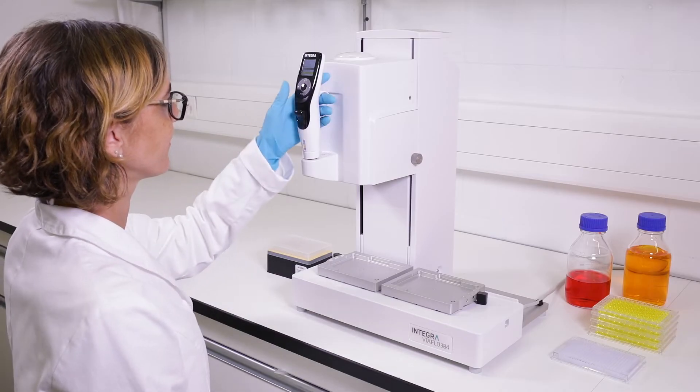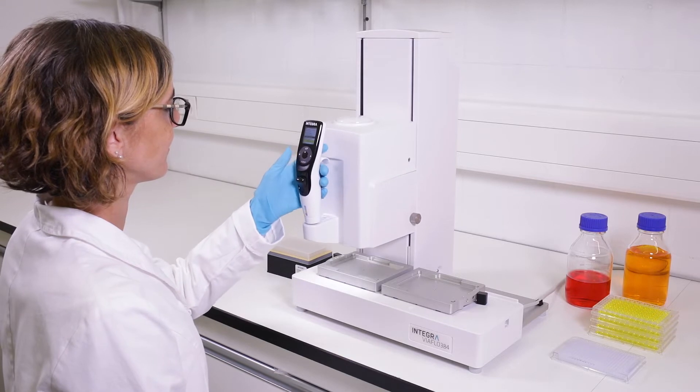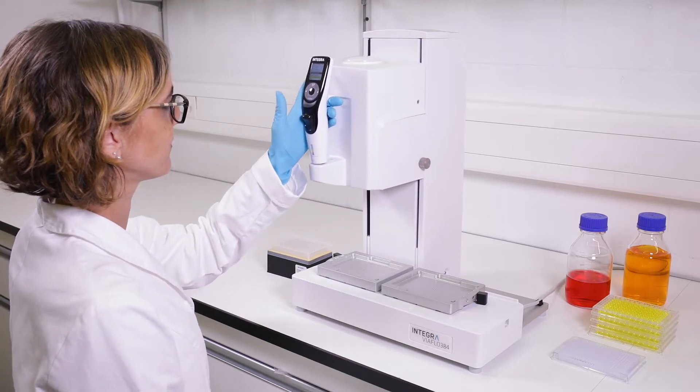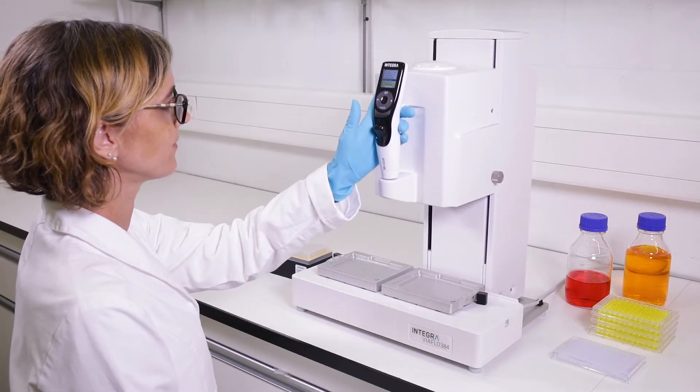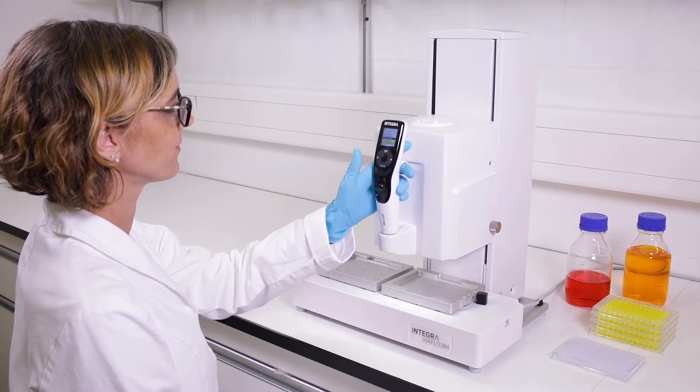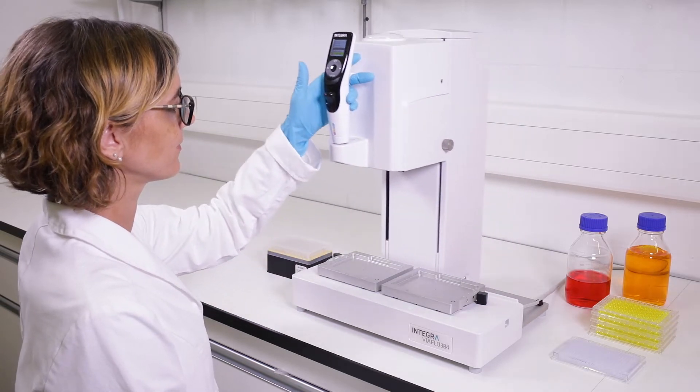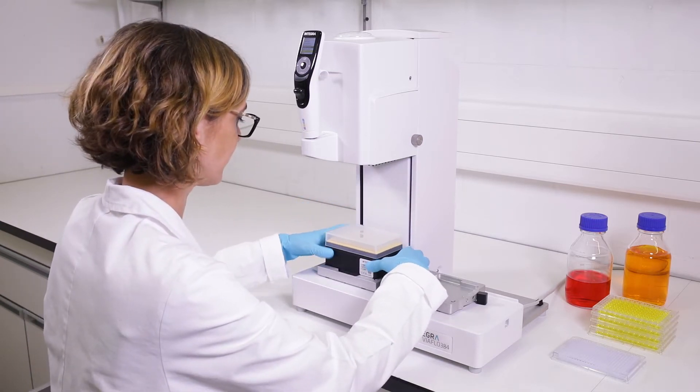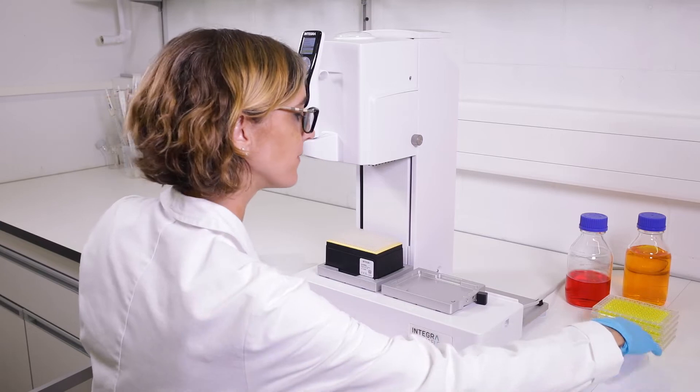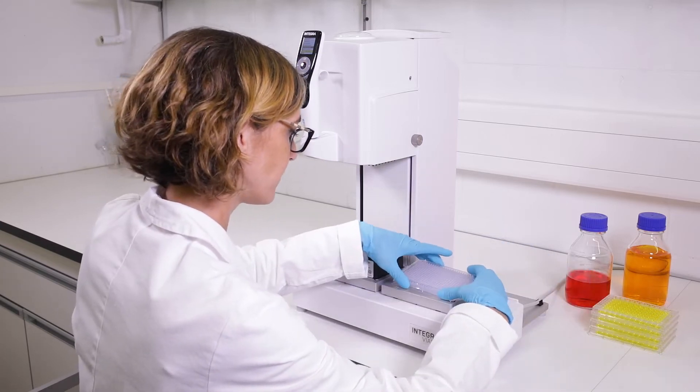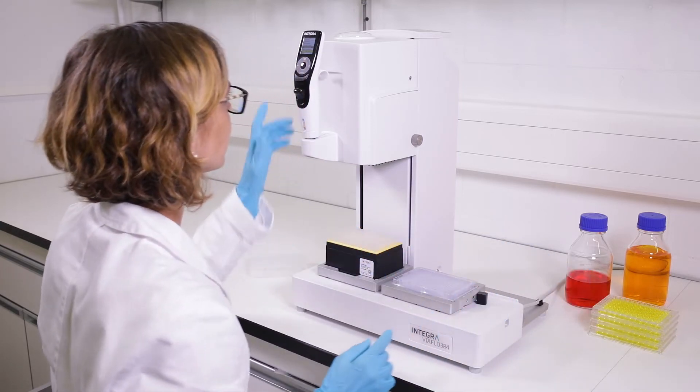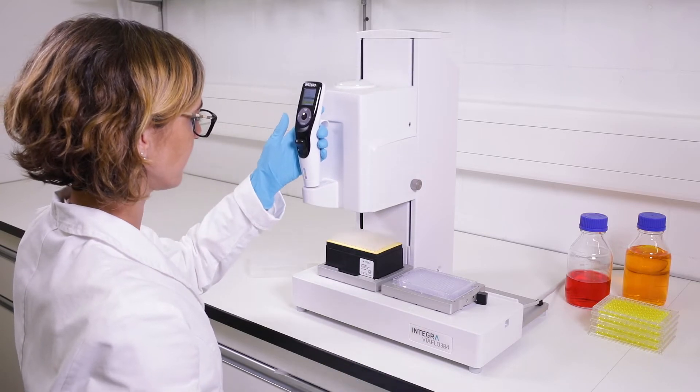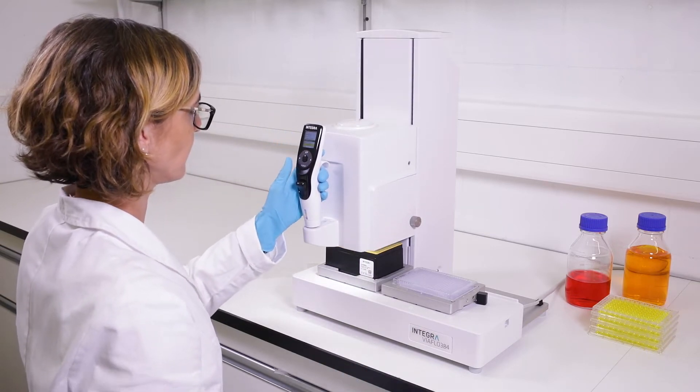The unique operating concept makes the ViaFlow 96 and 384 as easy to use as any handheld pipette. It's manually operated, but supported by strong motors for effortless and precise movements. Thanks to our well-proven grip tip system, the pipetting tips will never loosen, leak or fall off. Tips are loaded electronically by the simple push of a button.